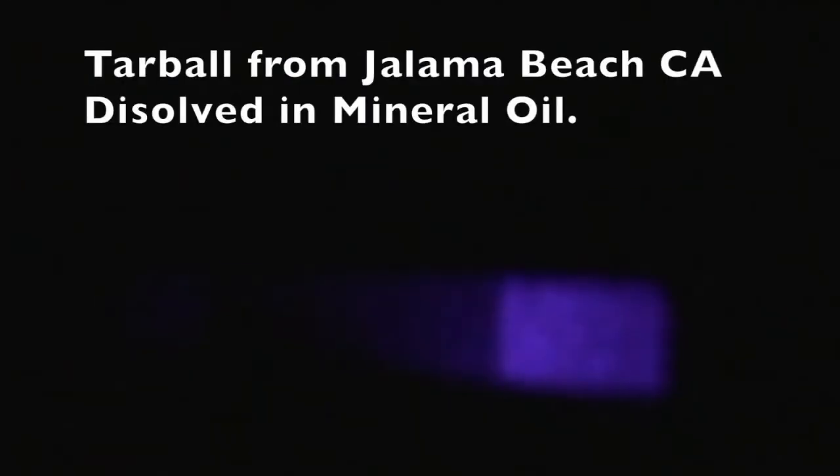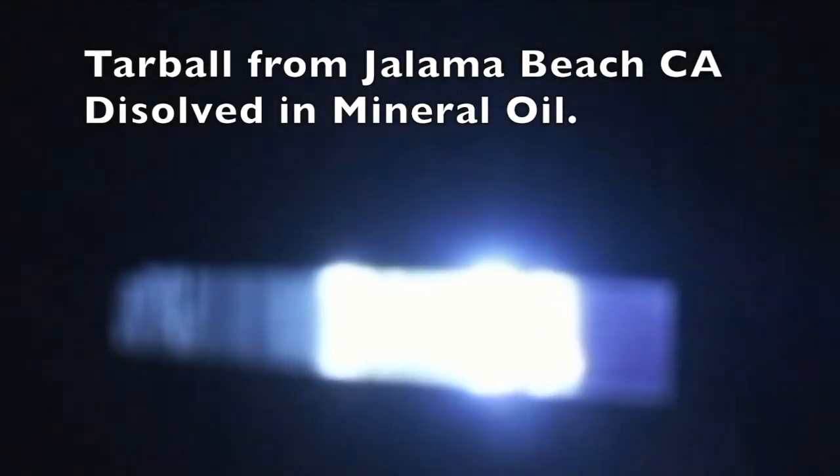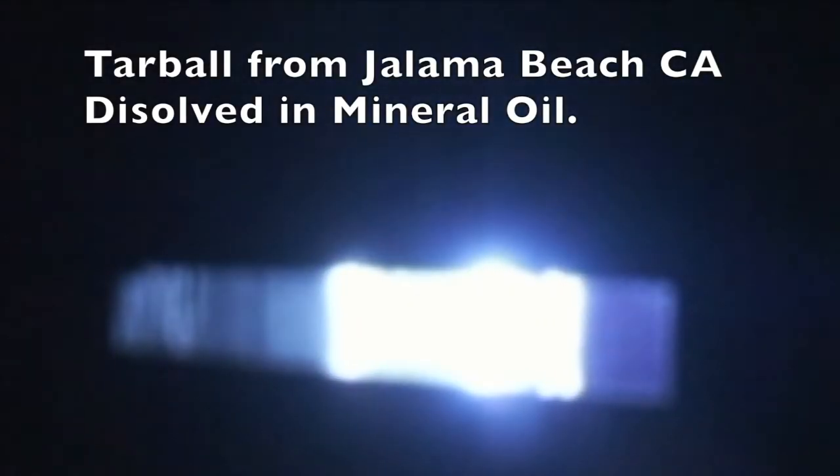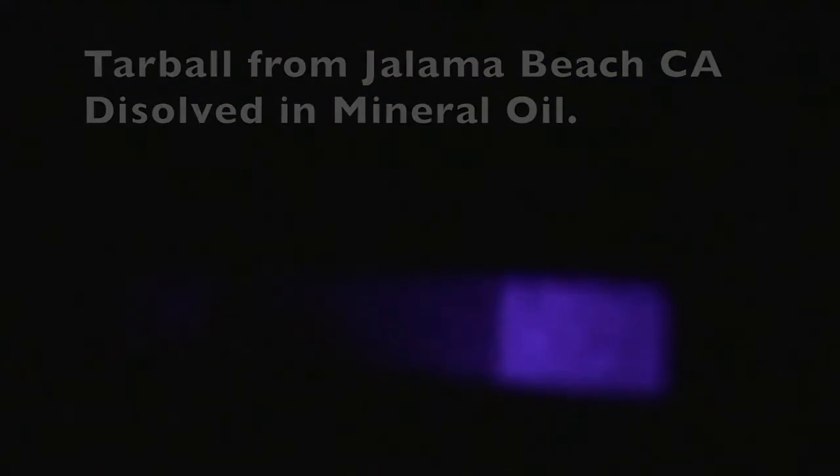Here, a sample of mineral oil is used to show a baseline of what happens with the laser. When we take that same laser and apply a 10W30 motor oil sample, we can see bright fluorescence. In a tar ball dissolved in mineral oil, that same fluorescence is also observed. The higher concentration of petroleum oil in a sample leads to more fluorescence observed.